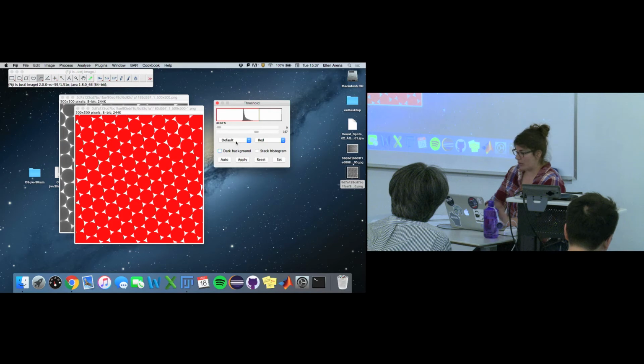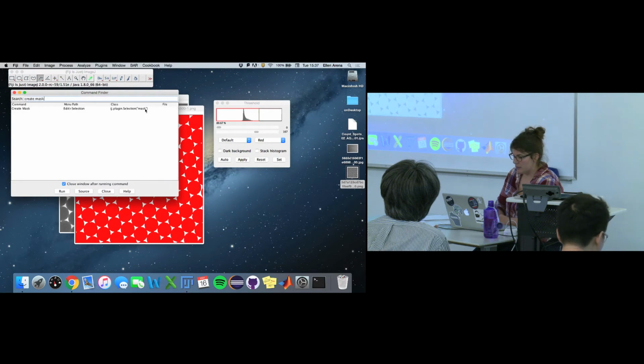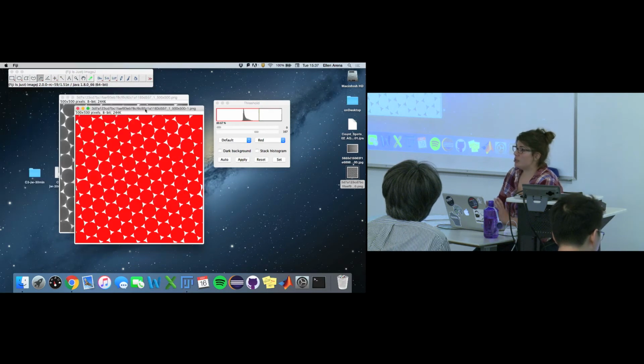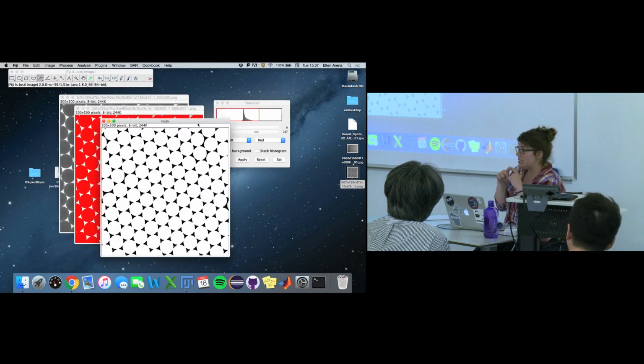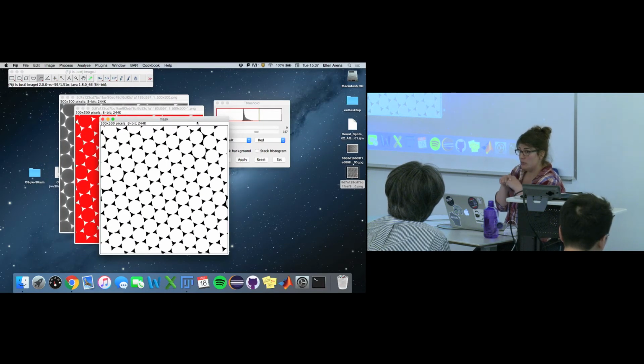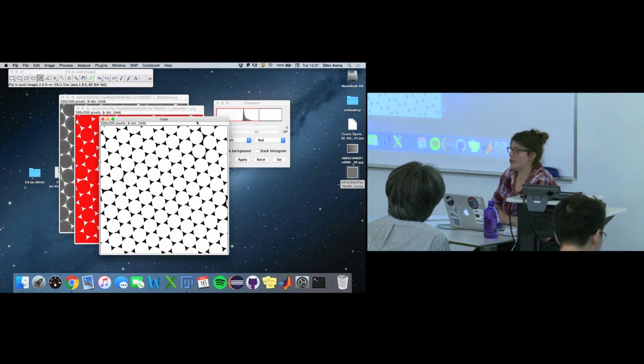So the next step, now we're happy with our threshold, we're going to just create mask. And boom, now we have our binary. But obviously these are going to be hard. We need to delineate each individual circle. So remember the algorithm we applied? Watershed, exactly. We're going to separate circular objects.